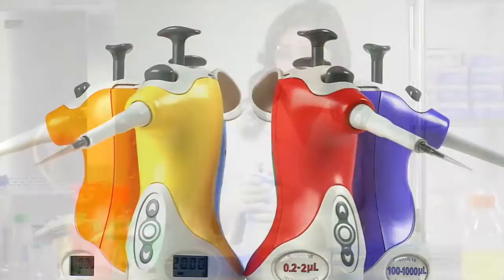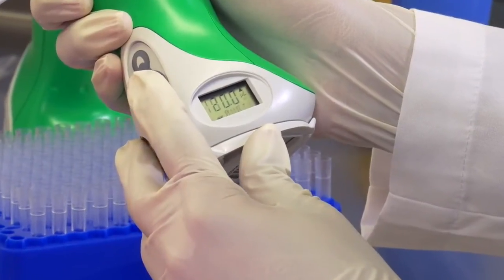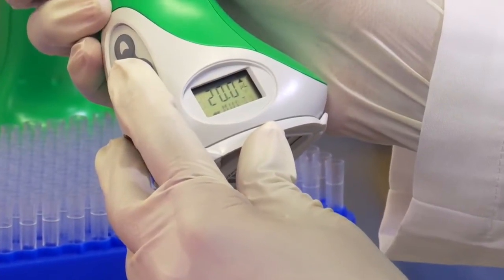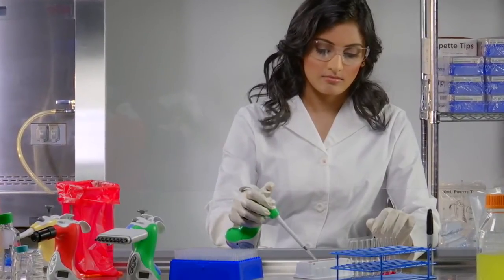Ovation is color-coded by volume, making it easy to identify and select even on the busiest lab bench. The EZ-Press keypad provides audible cues that ensure aspirating and dispensing of your samples is accurate and consistent every time.